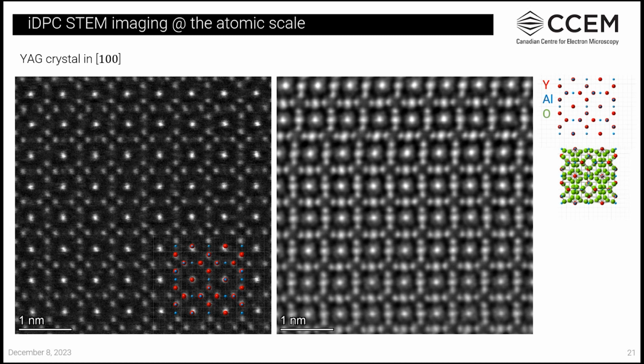And then, yeah, I would just say that with this, it's very nice images, but you really do need a nice thin sample. So shout out to Bhavesh for making the sample here. This is really nice and really thin, so it really allowed us to see that. But if you do not have a thin sample, it needs to be extremely thin to do this. So something like 70 nanometers doesn't work the greatest. It will still work, but ideally you'd want a really nice thin sample for this technique.